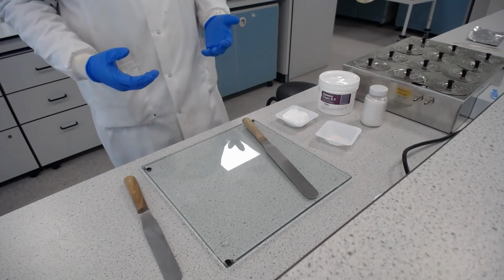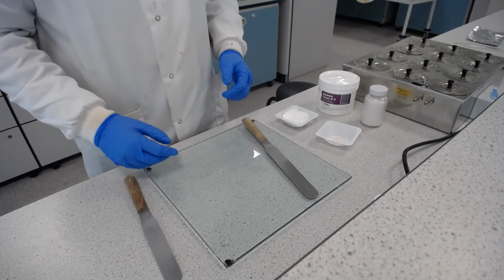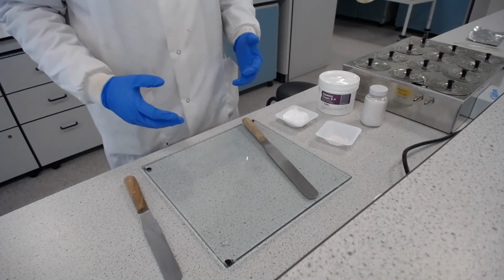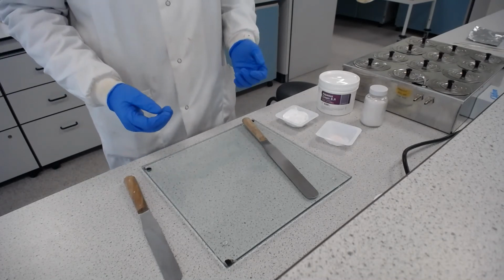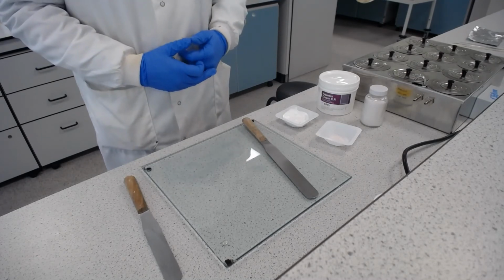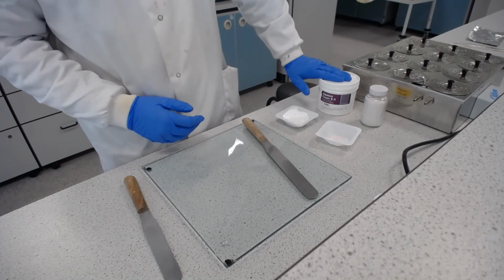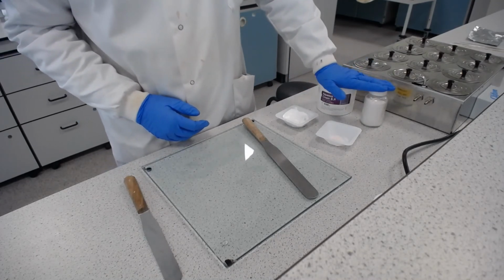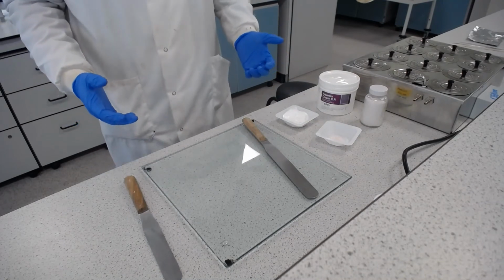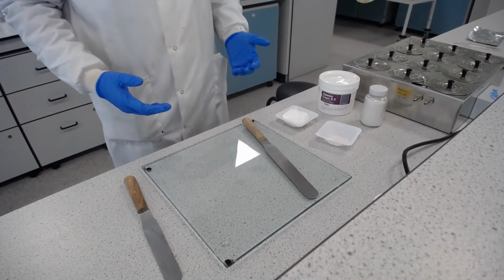And then we dilute it further to the final concentration needed. I thought I'd show you this technique because it is one that is still relatively widely used to get to specific strengths of creams or to put some rather different ingredients into common cream bases. So we're going to use aqueous cream, and I'm just going to use some calamine as well, just to show you a very common cream that you might come across and how that's made using a levigation method.